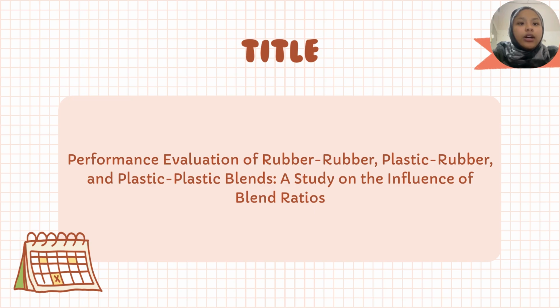The title of our experiment is a performance evaluation of rubber blend, plastic rubber blend and plastic blend. This study looks at the influence of the blend ratio of the polymer blend.